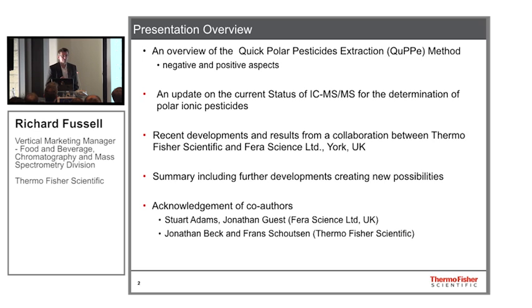the UK. And many of you know that I used to work for Fera, and I actually set up the ion chromatography system in Fera about 7 or 8 years ago, specifically to analyse glyphosate. So for me, it's just a continuation of an ongoing story. And then I'll give you a very brief summary and just a couple of slides to show you what some of the future possibilities are in using ion chromatography.